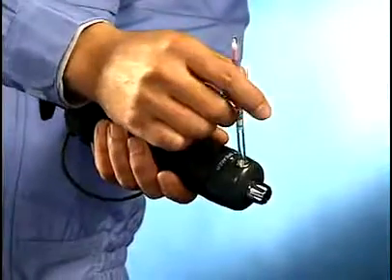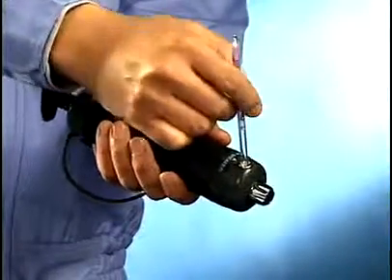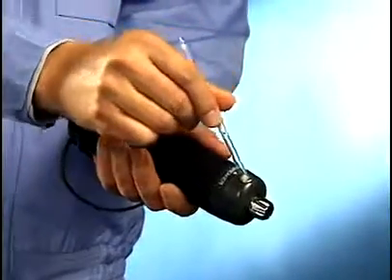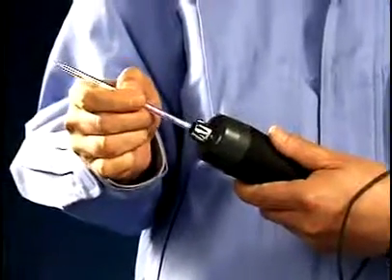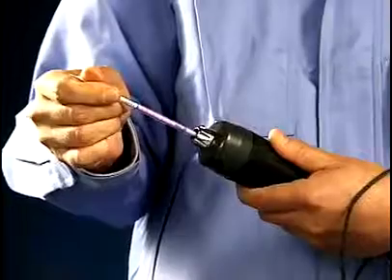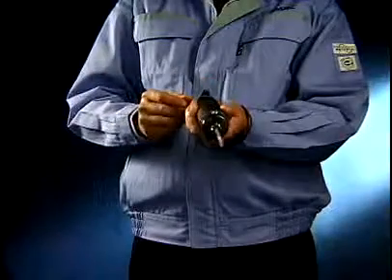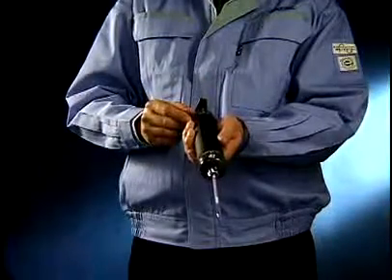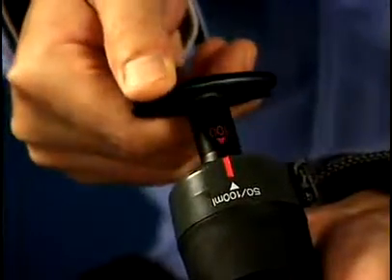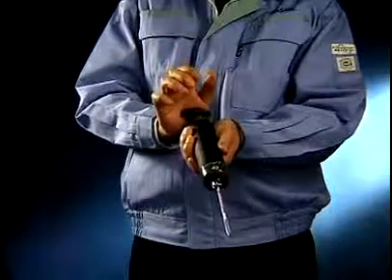Repeat the procedure for the other end. Insert the detector tube in the pump so that the arrow of the G mark points towards the pump. Align the handle with the guide mark for the sampling amount as indicated in the instructions — 50 or 100 milliliters. Make sure that the handle is pushed in.